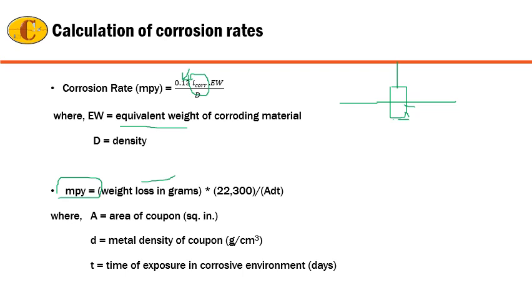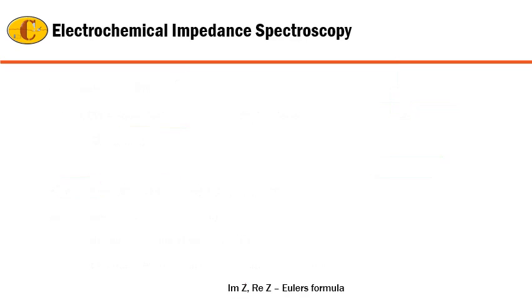Thus when you're trying to check how the corrosion in the pipelines or reactors is happening, or you want to analyze how much the corroded part has got corroded, or what are its electrochemical properties, these three tests are really important. The next is electrochemical impedance spectroscopy.